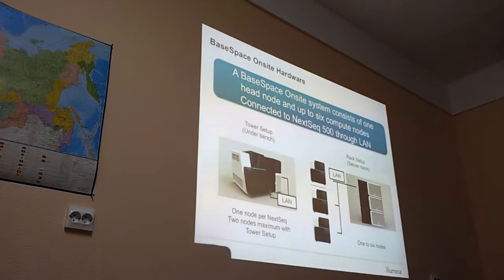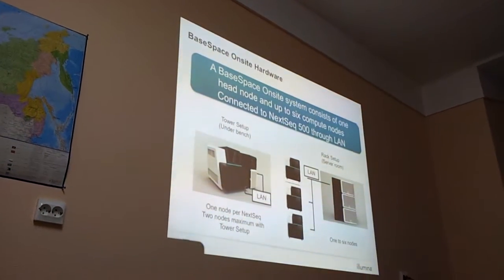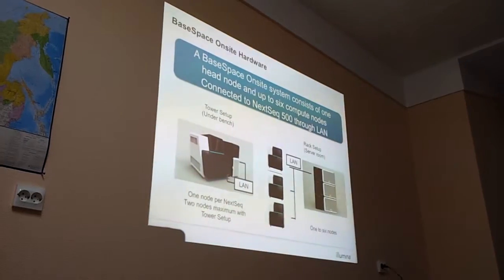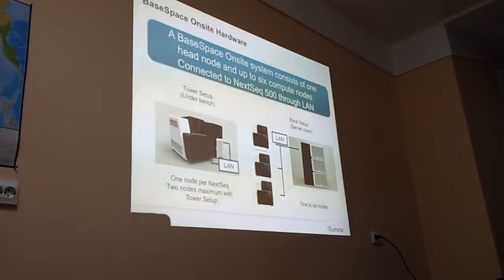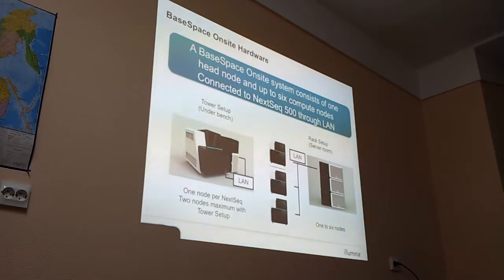Yeah, so this is what it looks like, and it's connected through a LAN, so a network, to your... So it's a kind of private network, yeah. So not internet, but a private internet. Yeah? So really the idea is that for data protection reasons you cannot put the data on the internet. You can generate your own network.